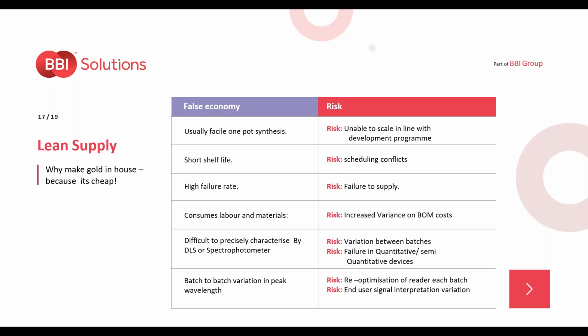Okay, but is it really cheap? It can be a false economy. If you go for that facile one-pot synthesis, that's great, but can you scale it up in line with your development program? Most of those techniques are not scalable.